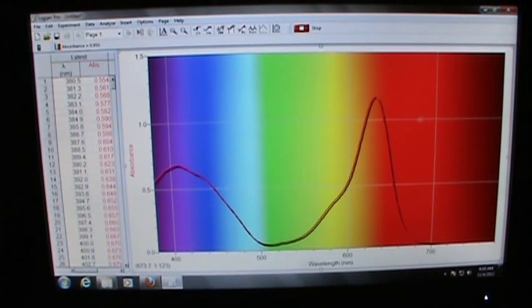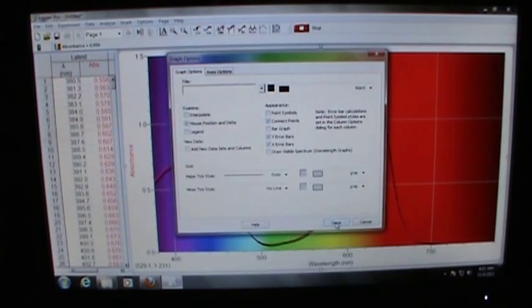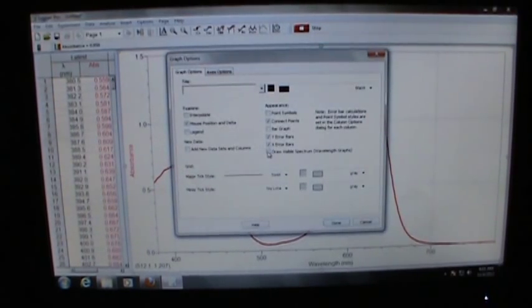Here you see a little bit of that background causing some trouble. If we really wanted to look at this closely, this red line, which represents the spectrum, kind of disappears over here. So having that in the background is useful for part of the experiment. If you ever want to turn it off, just to get it out of the way for a minute, you can turn it off. You can always turn it right back on.